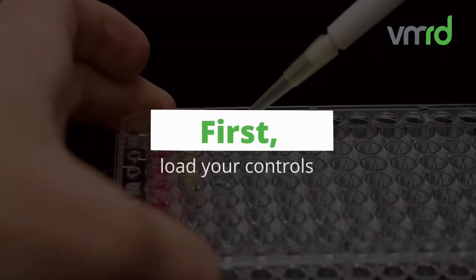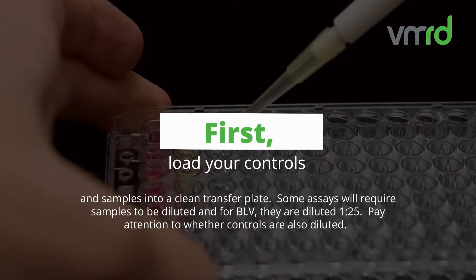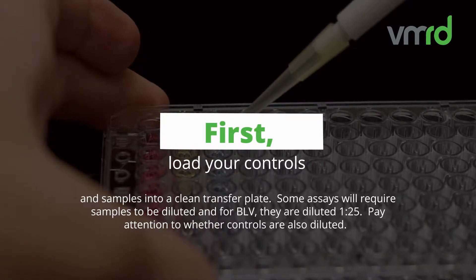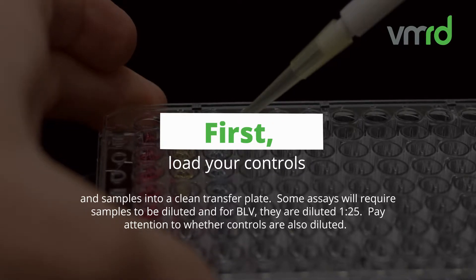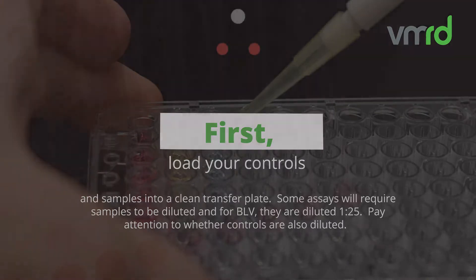First, load your controls and samples into a clean transfer plate. Some assays will require samples to be diluted, and for BLV, they are diluted 1 to 25. Pay attention to whether controls are also diluted.